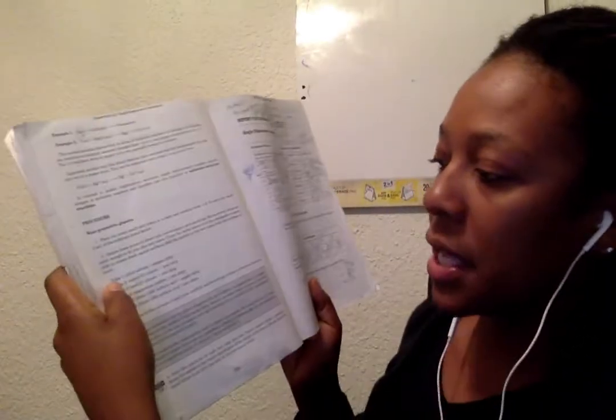And so in the procedure, she has 6 different test tubes and several different strips of metal, so copper, lead, and zinc. So each one of those are like strips of metal that will be placed into a solution of some sort. And then just try to, like I said, maximize the videos, right, so that you can really see what's going on.